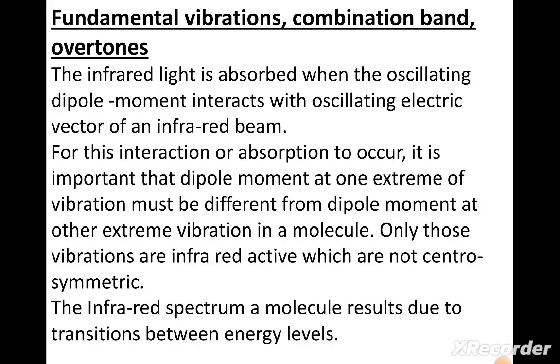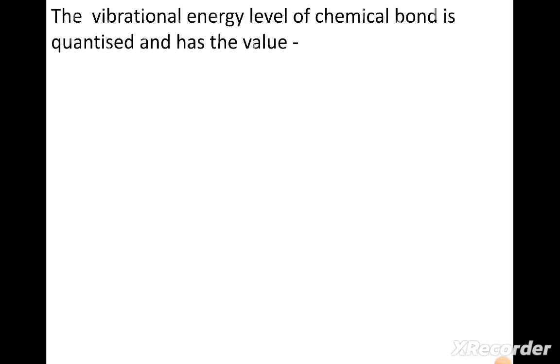The infrared spectrum of a molecule results due to transitions between energy levels. The vibrational energy level of a chemical bond is quantized.